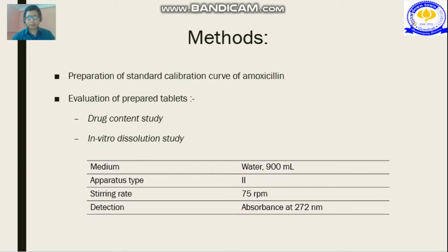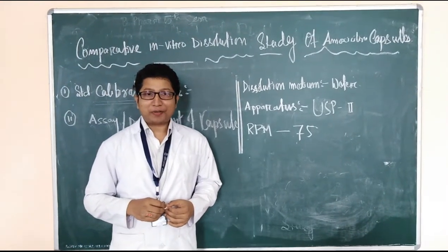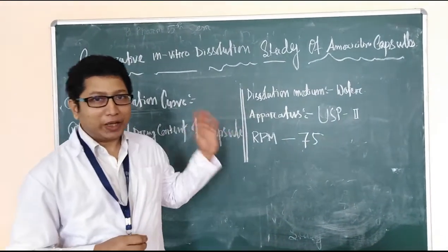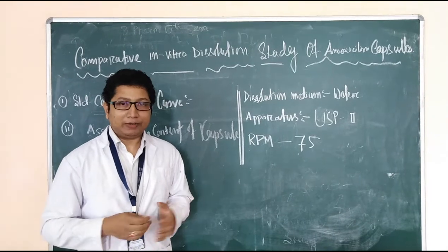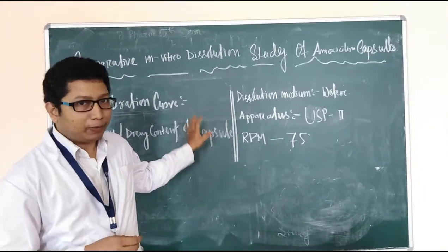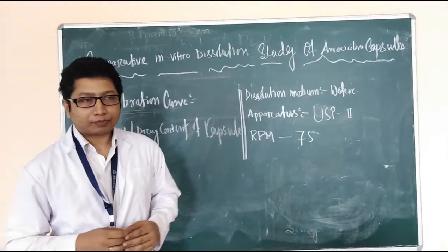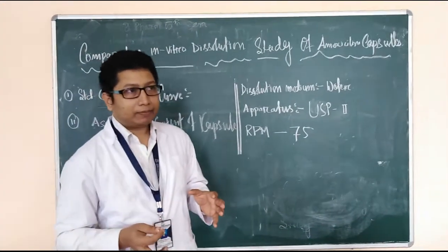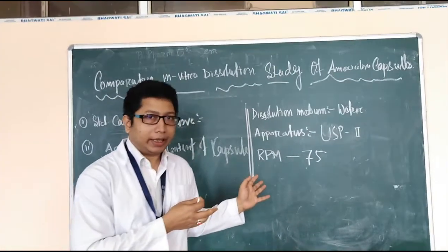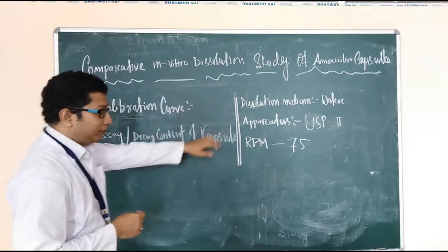Let's follow the demonstrations first. So, very good afternoon to all. Today we are going to discuss one practical which is incorporated in the syllabus of the semester. We will perform the in vitro dissolution study of amoxicillin capsule. To do this practical, we have to perform a number of steps. What are the different steps?